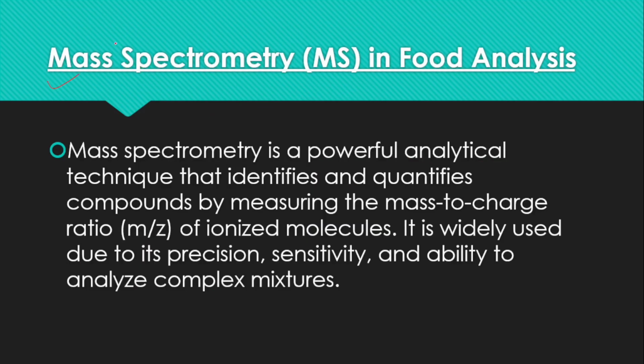Now coming to mass spectrometry in food analysis. It's a powerful analytical technique that identifies and quantifies compounds by measuring the mass to charge ratio of ionized molecules. It is widely used due to its precision, sensitivity and ability to analyze complex mixtures.